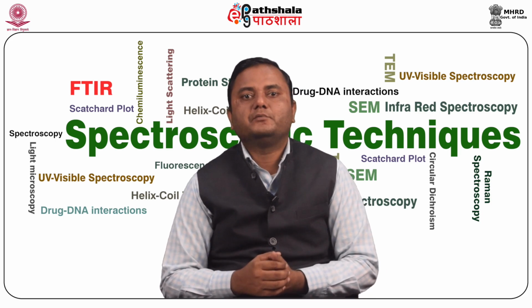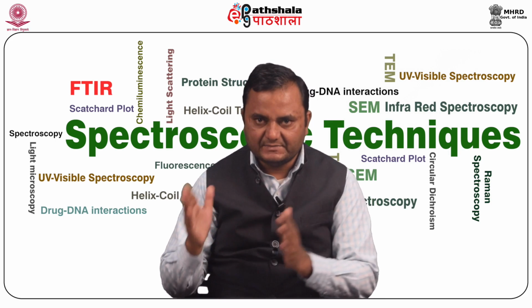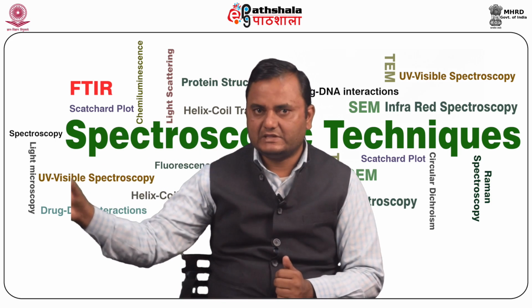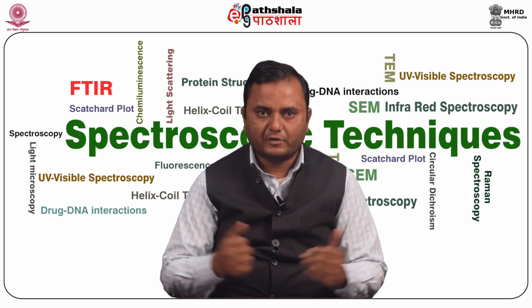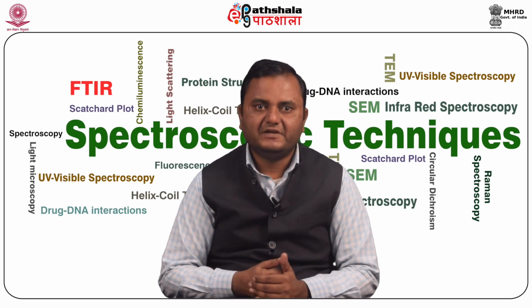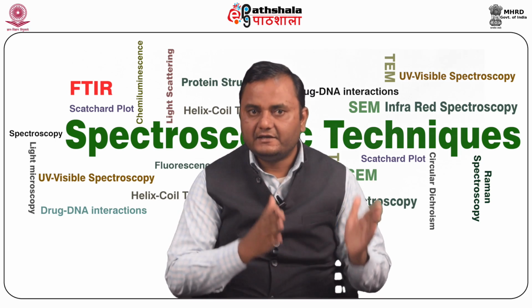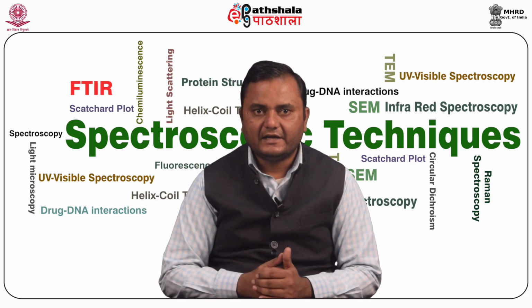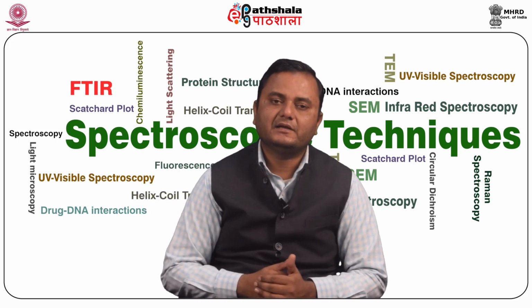Now we talk about the components of FTIR. It has a simple light source, where IR energy is emitted from a glowing black body source, which ends with the detector, and it is coupled with the interferometer. The beam enters the interferometer where the spectral encoding takes place, and the interferogram signal then exits the interferometer, and the beam splitter takes the incoming beam and divides it into two optical beams.